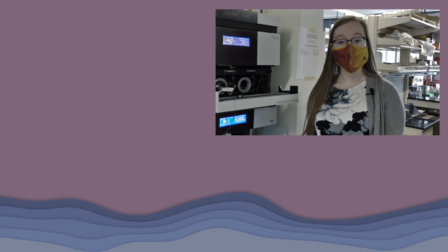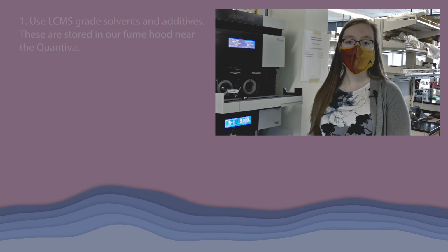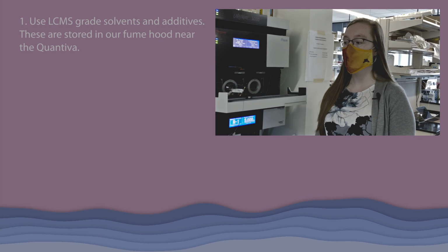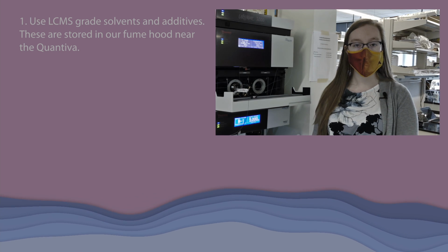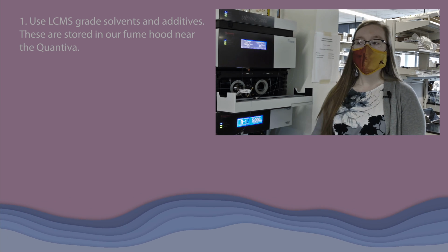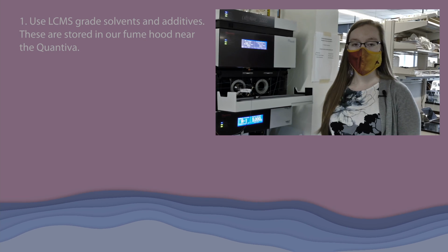So your first step will be to prepare your solvents. These solvents should all be LCMS grade solvents and LCMS grade additives to prevent any damage to the instruments, as salts and other interfering compounds can be very problematic for the mass spectrometer. So to do that, we have these solvents and these additives over in our mass spec fume hood, and those are the ones that should be used for this.